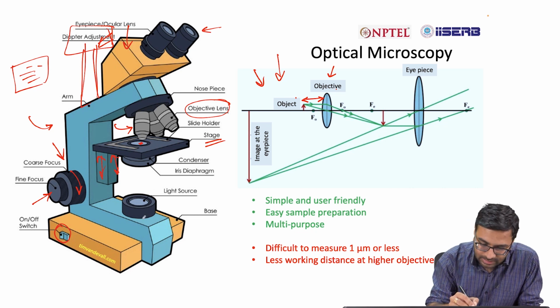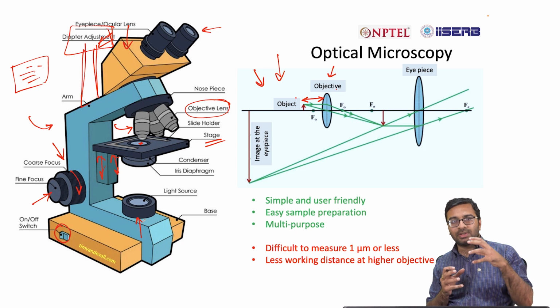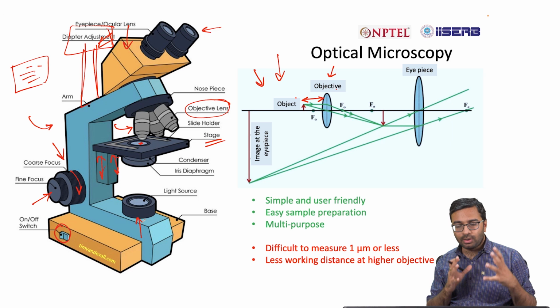And in certain cases light sources are at the bottom. So it depends on whether your microscope is upright or inverted, right? These details, to some extent, you already know.